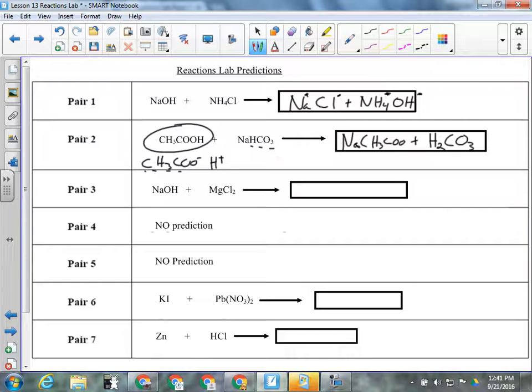It bubbles and fizzes like crazy. What does that mean is being produced? A gas. Are there any gases written there? There's 2 ionic compounds, which are crystalline solids at room temperature. Probably that's not right. That's okay. We're just predicting it according to the rules that we know.